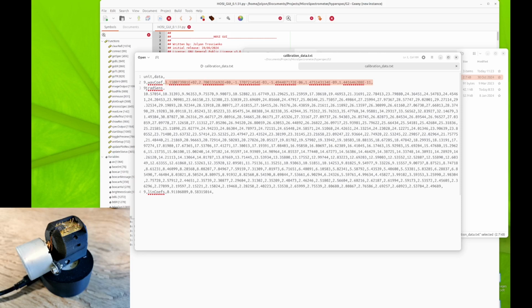Also specific to each unit will be this radiance sensitivity information. So you need to ideally measure your system relative to some known radiance. So use a spectroradiometer that has been calibrated itself to measure some light source, measure that same light source with this HOSI system, and then you can use the script to calculate these radiance sensitivity data.